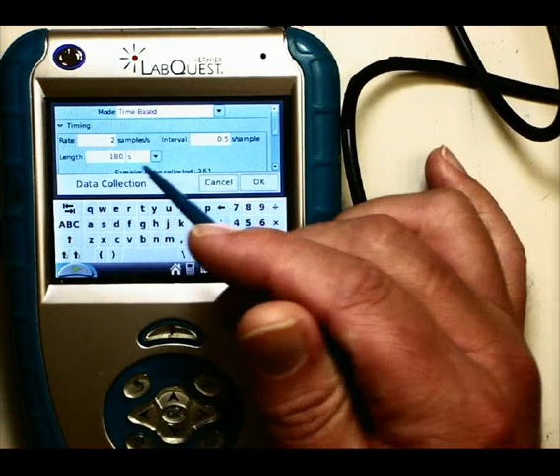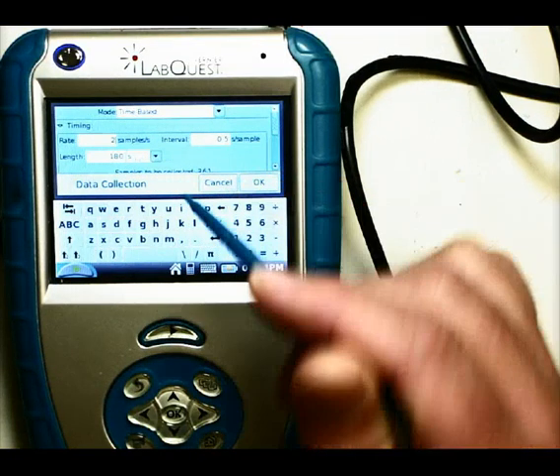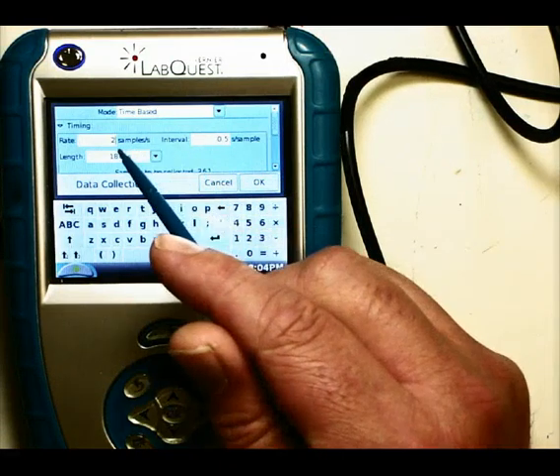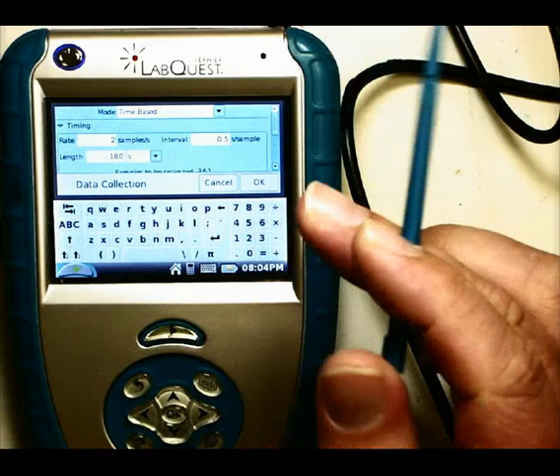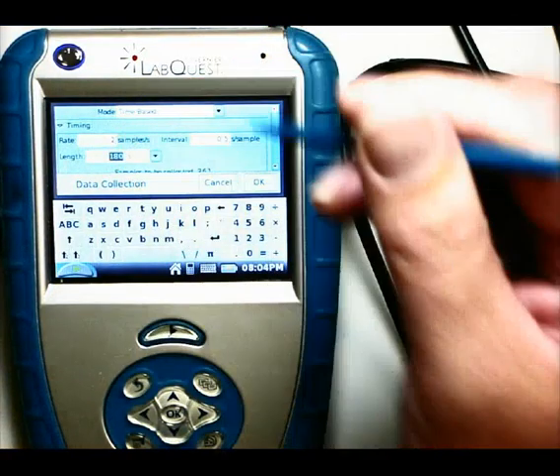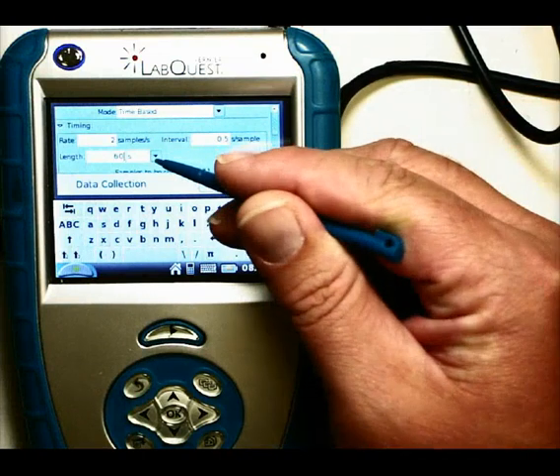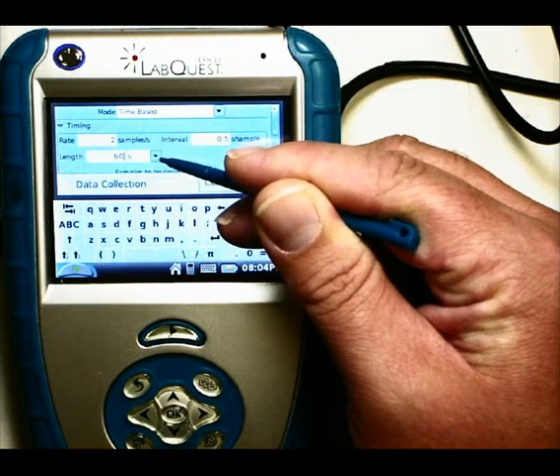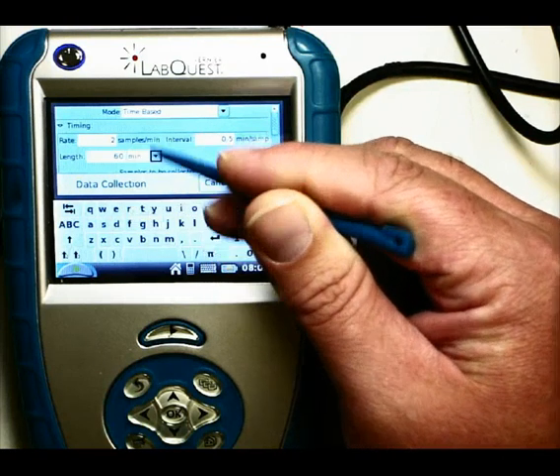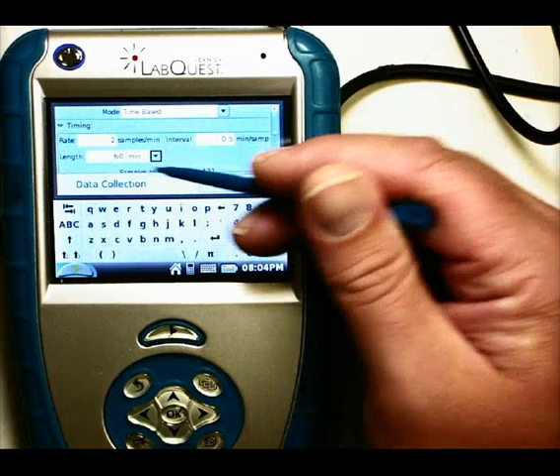Length tells the LabQuest how long it should record data. Right now it's set to record for 180 seconds, and it's going to take two samples every second, so it's going to collect a total of 360 data points about the temperature. We can change this to whatever we want. If instead of 180 seconds we just want to do it for one minute, I can type 60 seconds. Or using the pull-down triangle, I can select different units — for example, I could tell it to collect for 60 minutes, so now it will collect data for an hour.